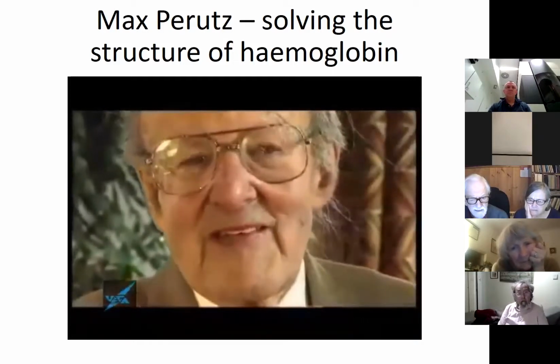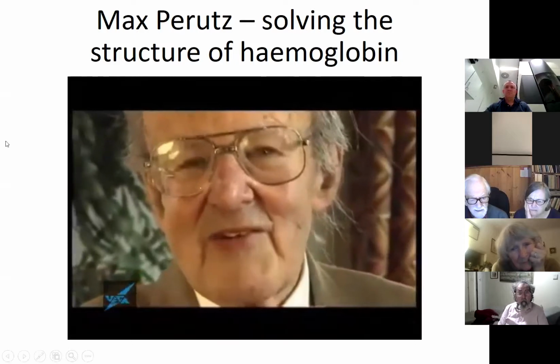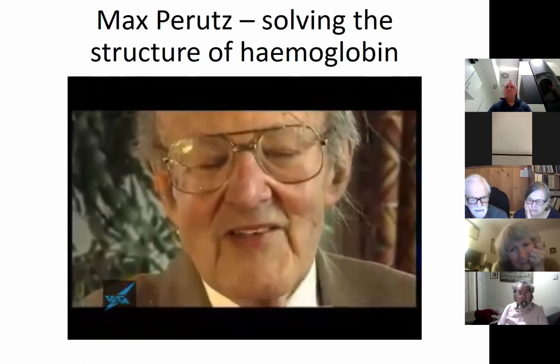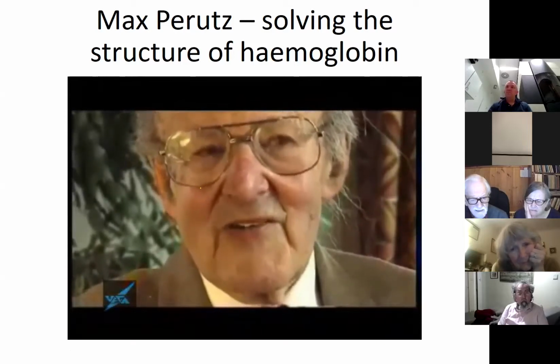The problem is that measuring the intensities gives you only half the information needed to solve the structure of the crystal. The other half is called the phase.